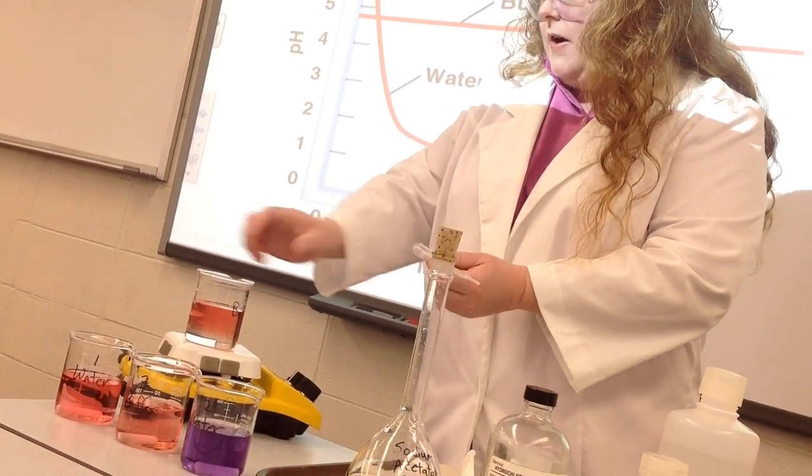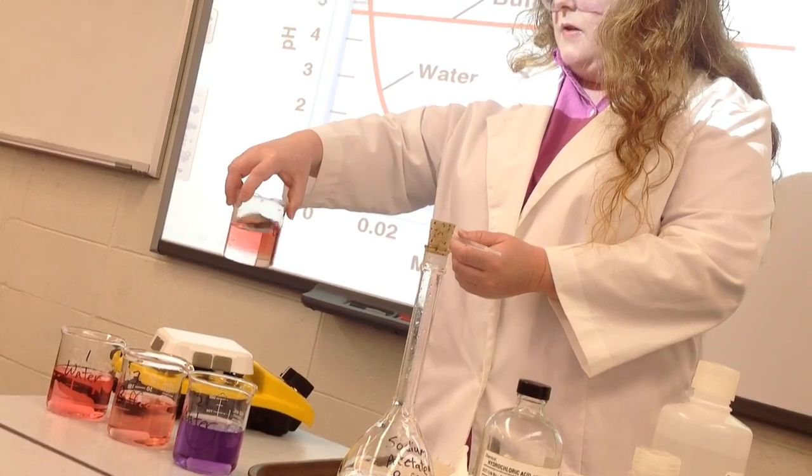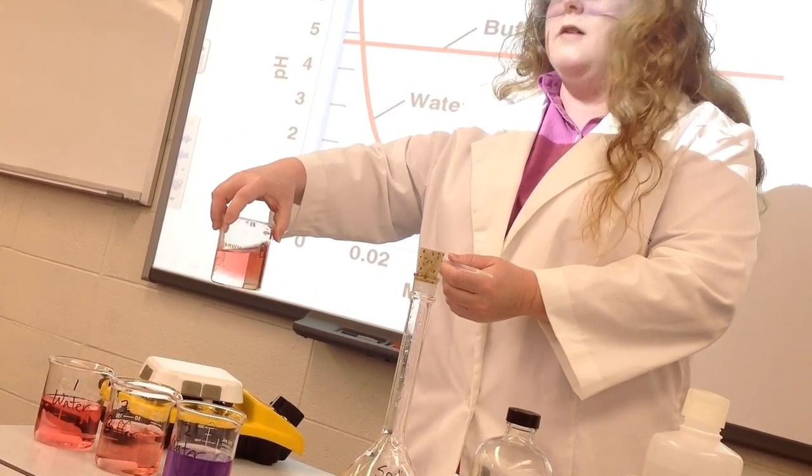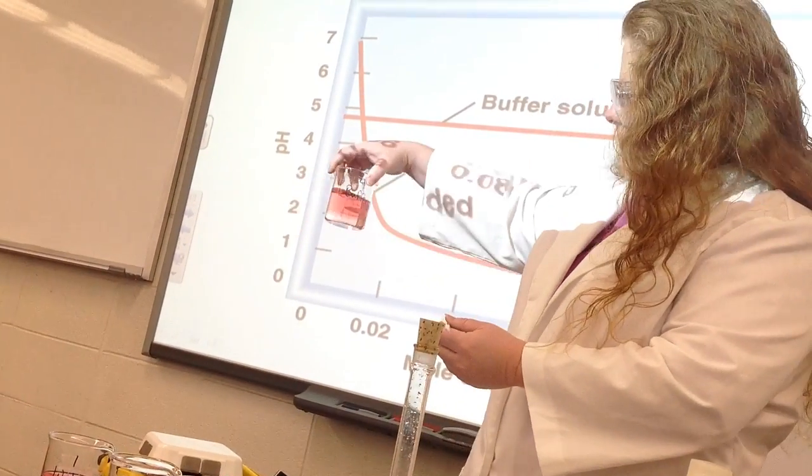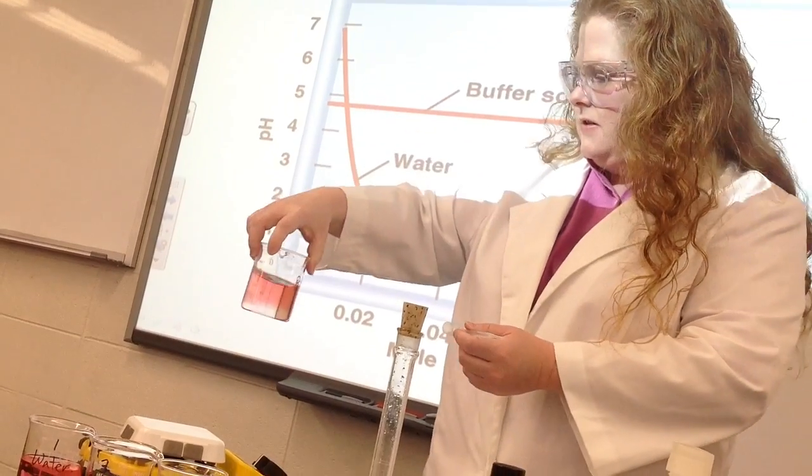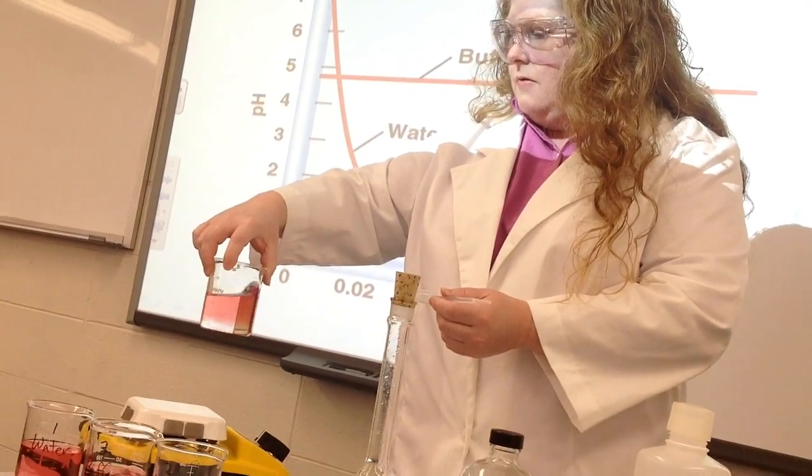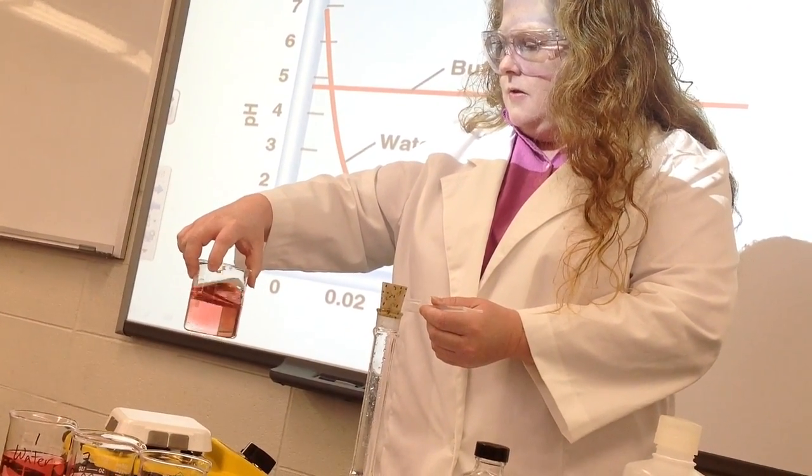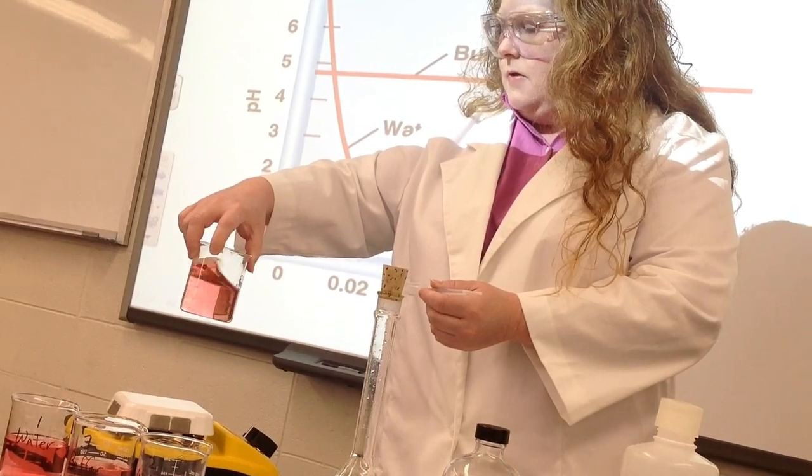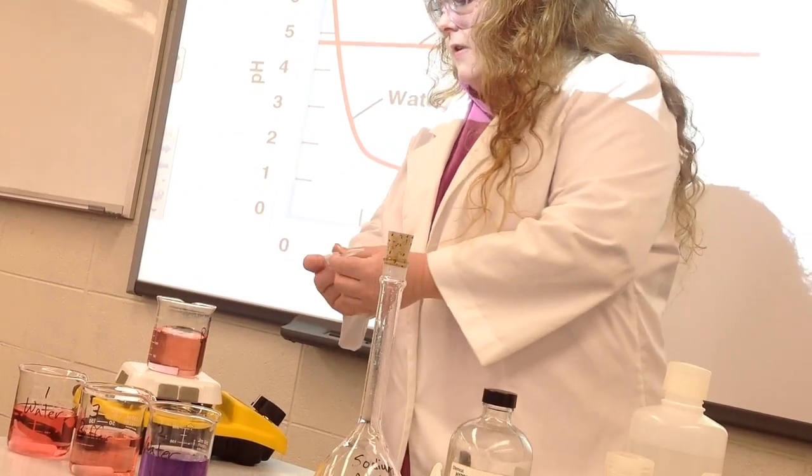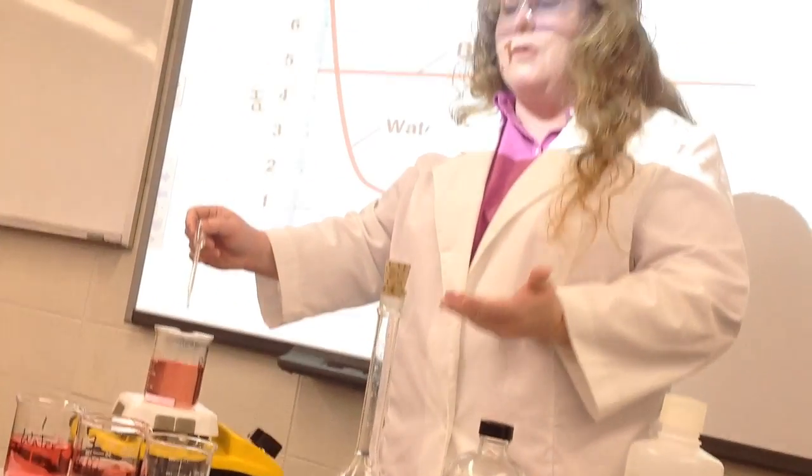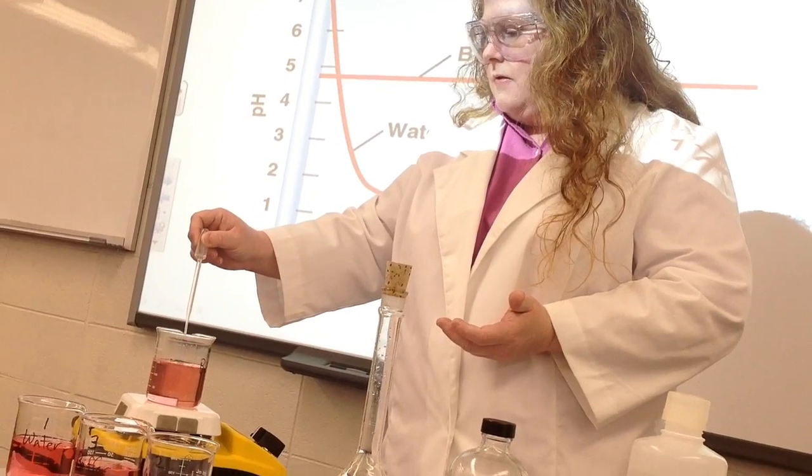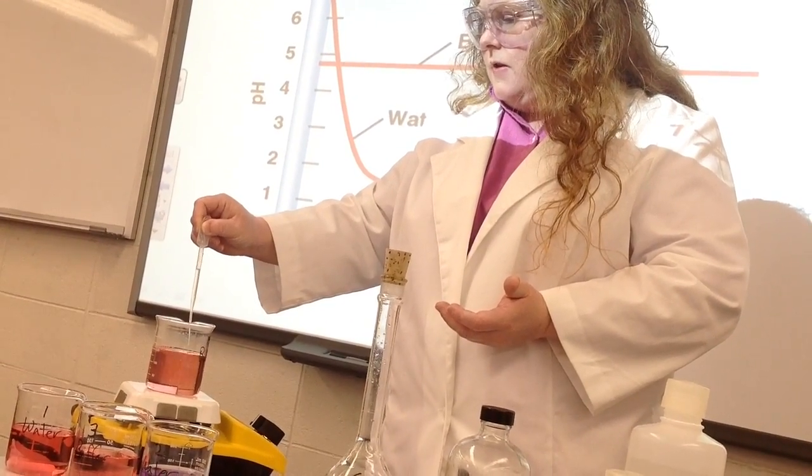Okay, so I've added three drops of my base and I don't see a change. I don't see a change. Of course the indicator isn't mixed all the way. So no change. Just go ahead and let's add in a whole dropper full. Let's see if we can get it to change.